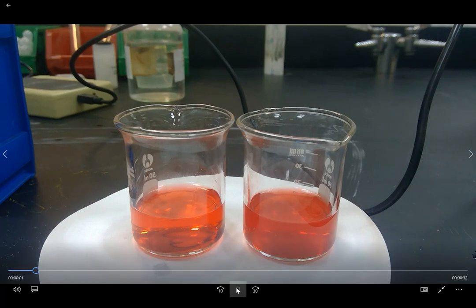Just coming back to my results with the universal indicator, I've put them both against a white background just because I didn't think the colour difference was very clear in the previous part of the video. So you hopefully now can see we've got the hydrochloric acid on the right and the ethanoic acid on the left. Hopefully now it's a little bit clearer that the one on the right is a redder shade of red, whereas the one on the left is slightly more orange because it's weaker.